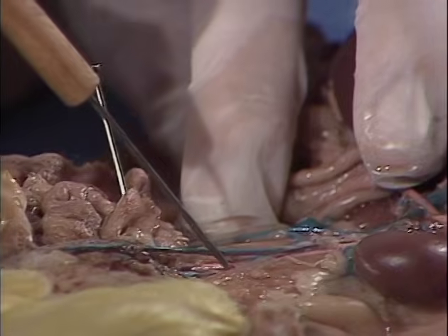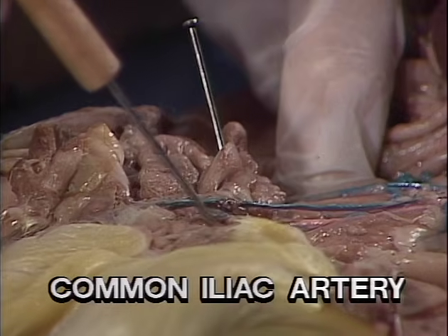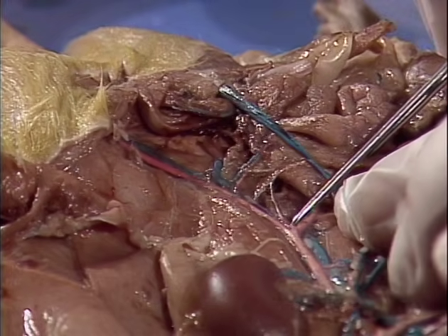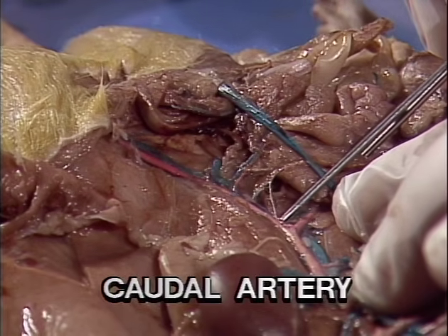Further down, we see a large branch coming off and going into the legs. This is known as the common iliac artery. If we look carefully, we see a small one going into the tail region, which is called the caudal artery.